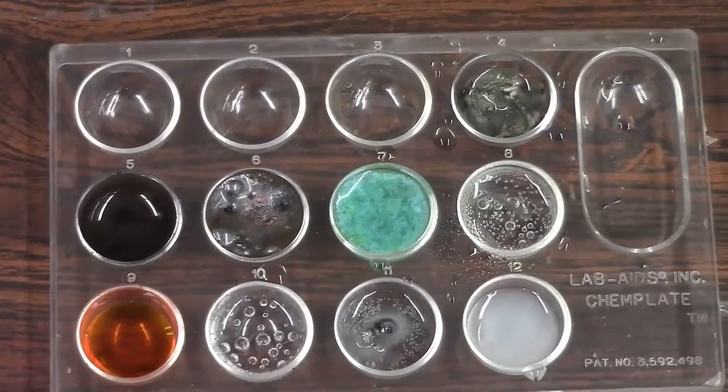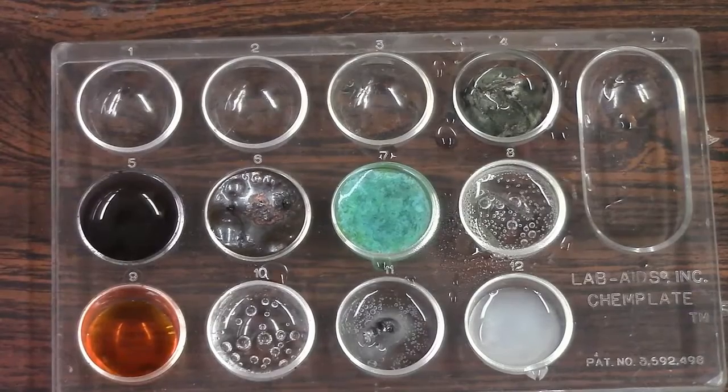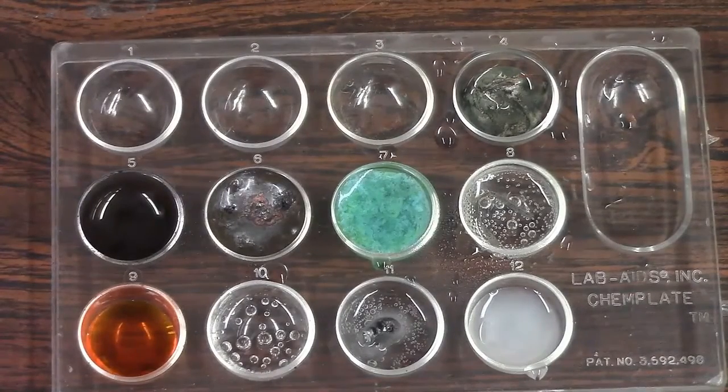All right, and those are all 10 reactions completed for us. Just now a quick visual to see an overview of all of them. What you'll be doing for this lab is you're going to be making sure you go through your observations table, finish up everything that was blank in there, fill in all the reactants with their chemical formulas, all their products with their formulas, describe the products, so write your observations, and describe the change.